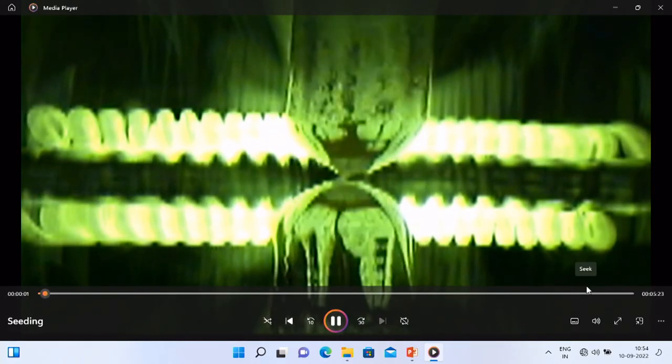Seeding is also right. This is where the temperature is 2000 degrees Celsius in the oxygen atmosphere, right? The top is feed, the bottom is seed. Slowly we try to melt it and make the seeding. I said the seeding is very, very important. Only then can you make it. Surface tension and other problems, you have to handle and then grow. Just forward it. The seeding will happen only at the last minute.